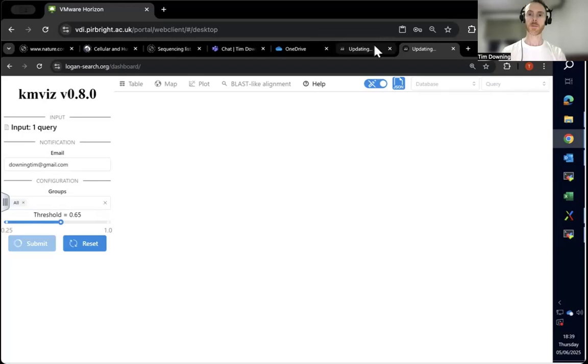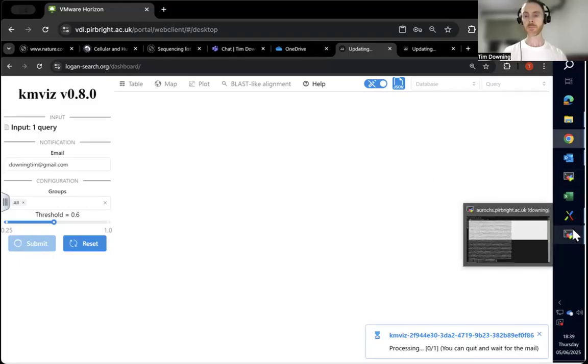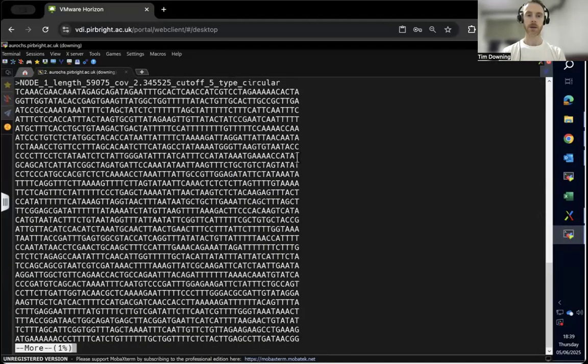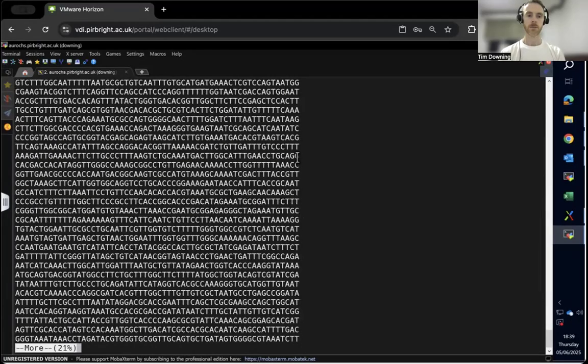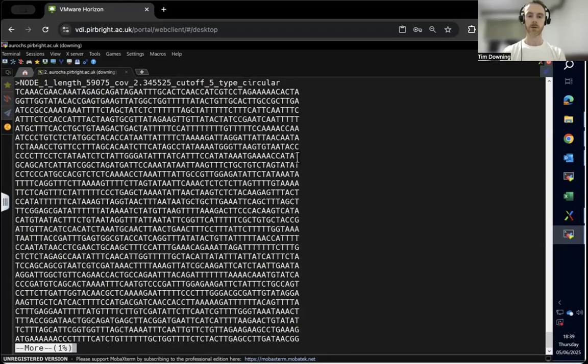So let's submit that as a job. I see that's running, and that will be sent to your email address in case you have a very long query or if something else goes amiss. So these are now running. What we could even do is look at the other ones in the sample, which are quite long.